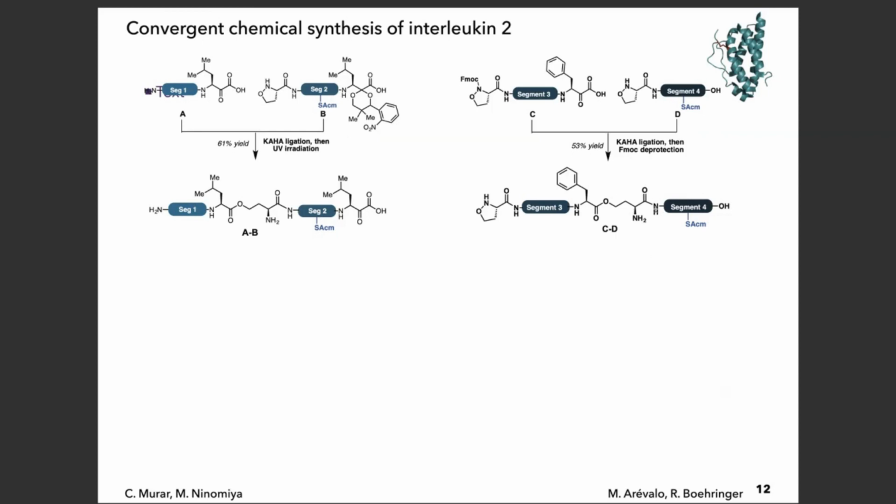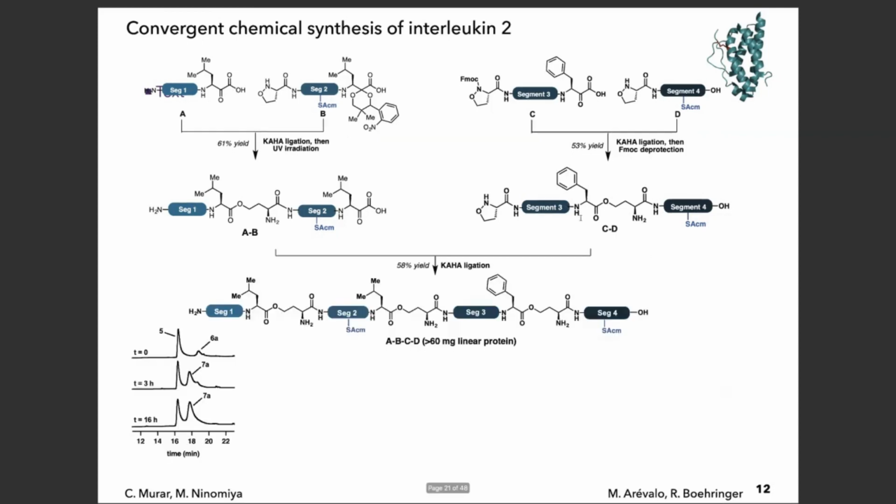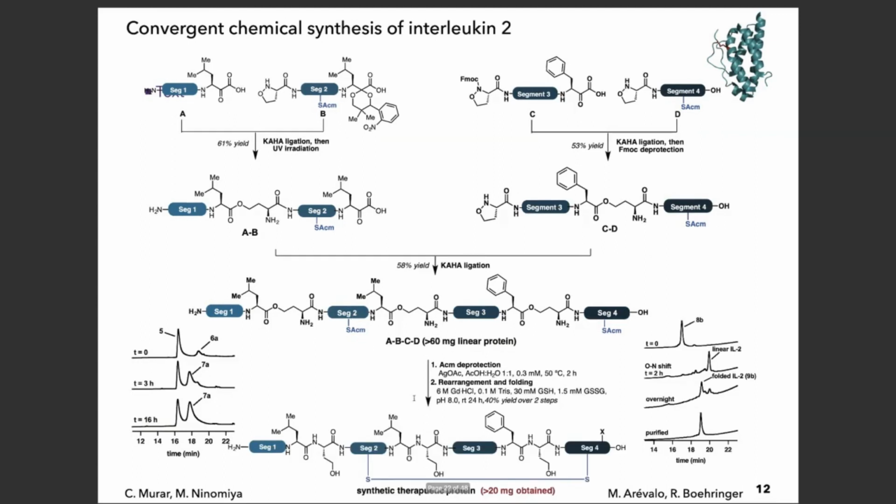here by base, and we purify those segments and then do a 3rd KAHA ligation to give us the fully assembled protein containing the 3 ester bonds, and then remove the Acm groups and subject that to folding to give us the fully assembled folded proteins.